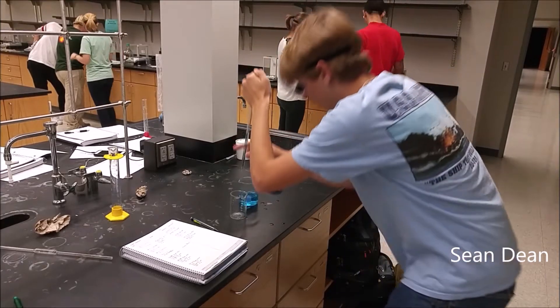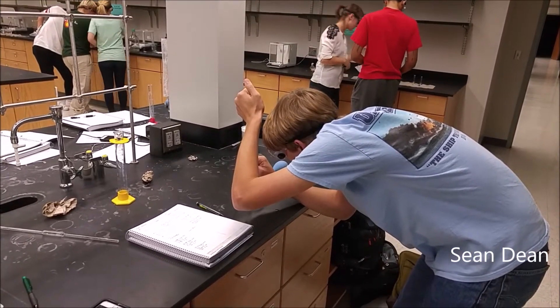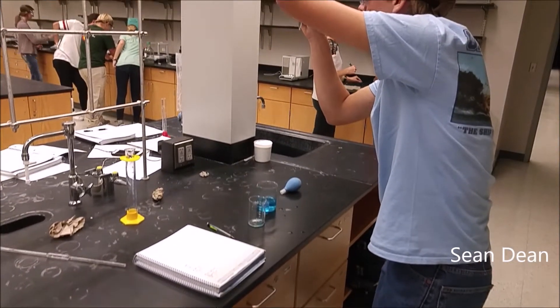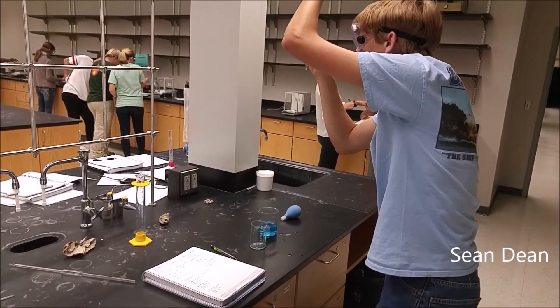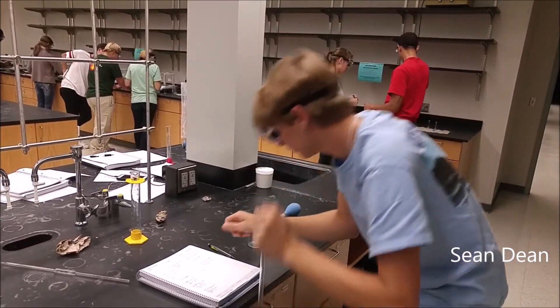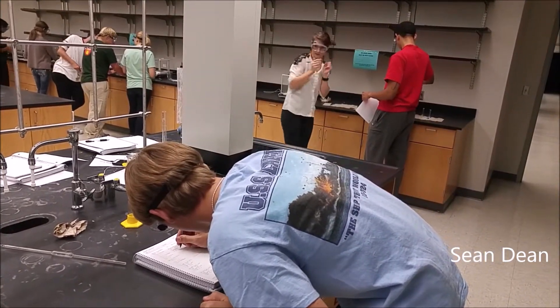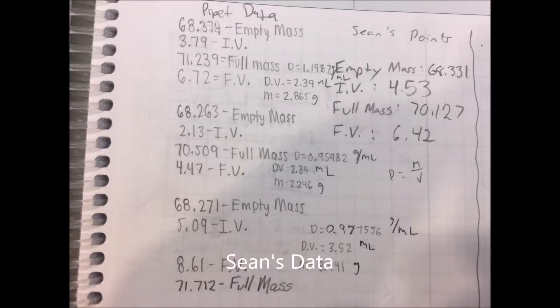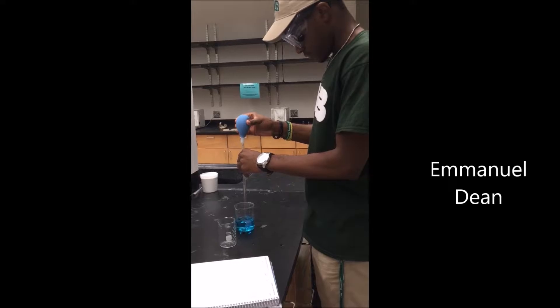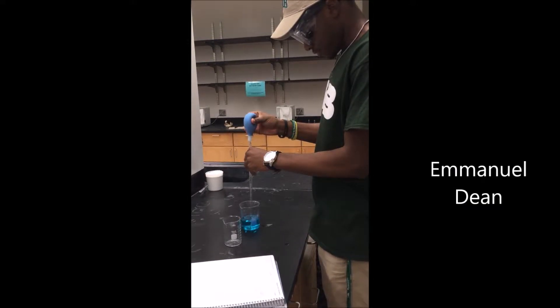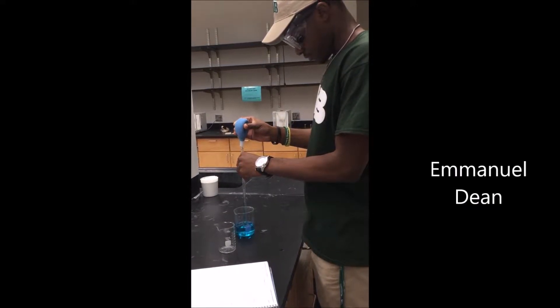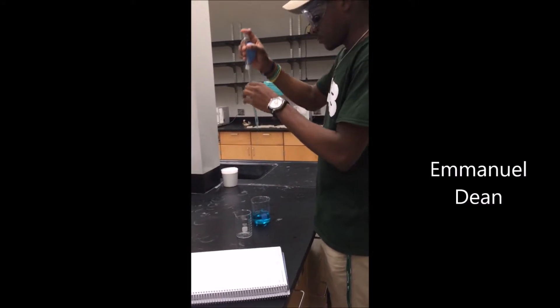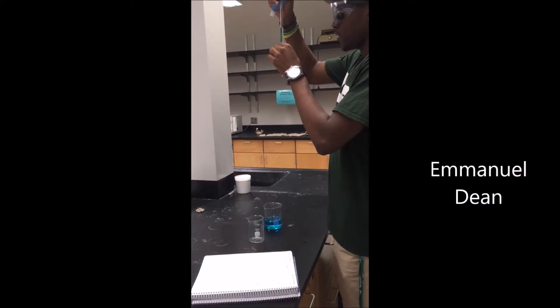First, he is collecting the solution for the initial volume. Then he records it in his lab notebook. Then he dispenses some of the solution into a beaker to get his final volume and records it.